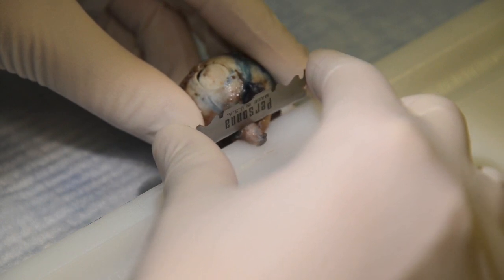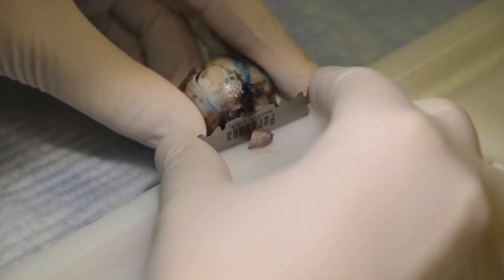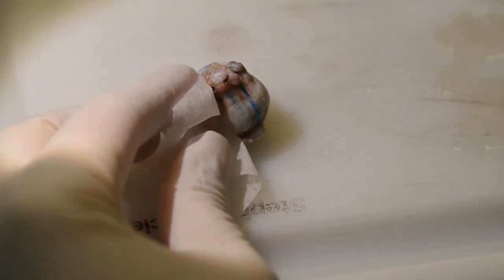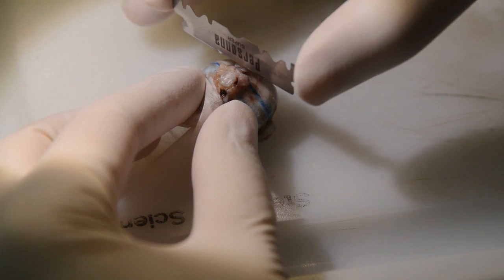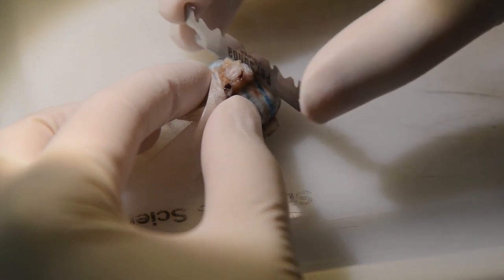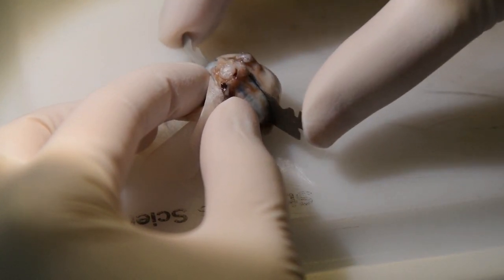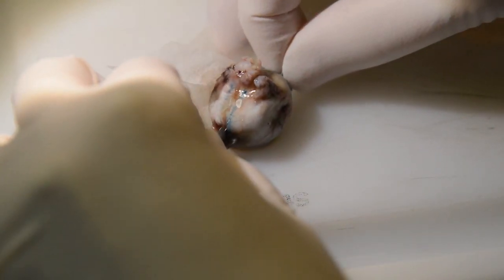Prior to opening the globe, a transverse section of the optic nerve is removed and submitted separately. This is done to avoid contaminating the surgical margin with tumor. Colored pencil is applied to the end of the optic nerve to mark the true surgical margin. During sectioning, the globe is positioned corneal side down. The cut is started posteriorly next to the optic nerve sheath, and a gentle sawing motion is used. This is converted to a two-hand technique to complete the cut.